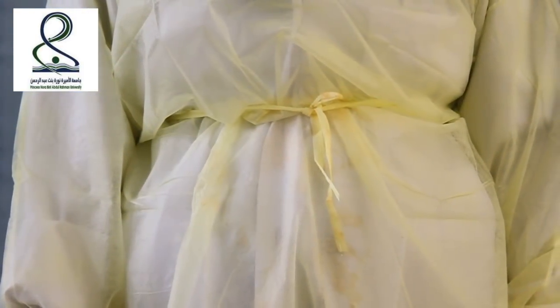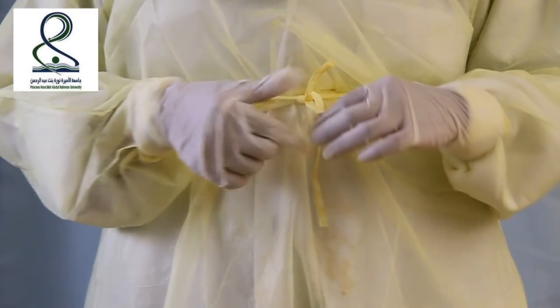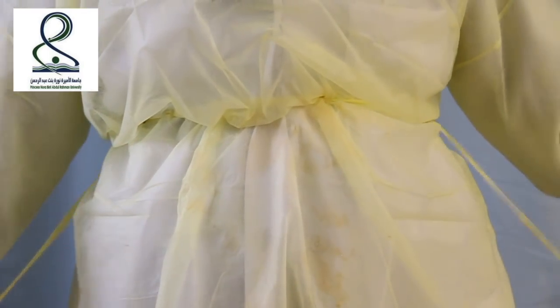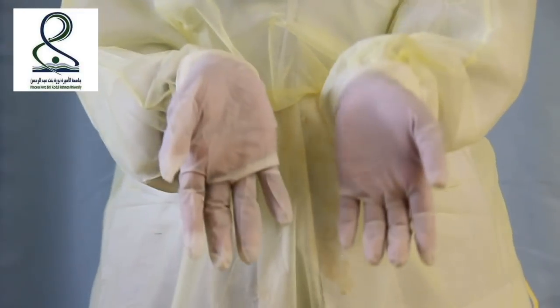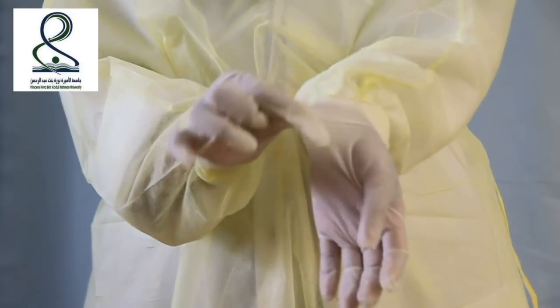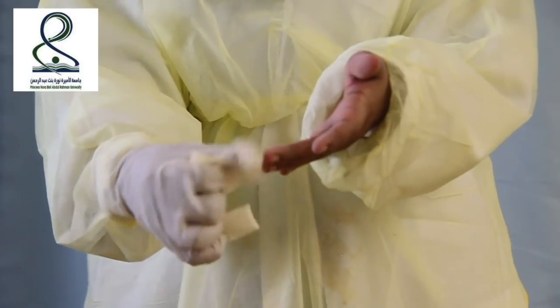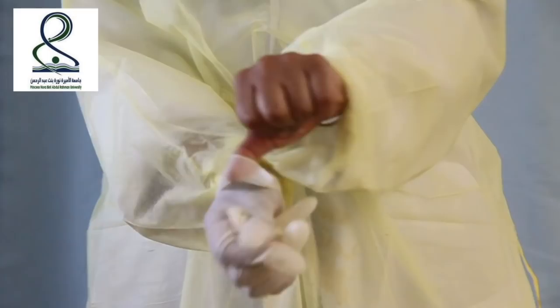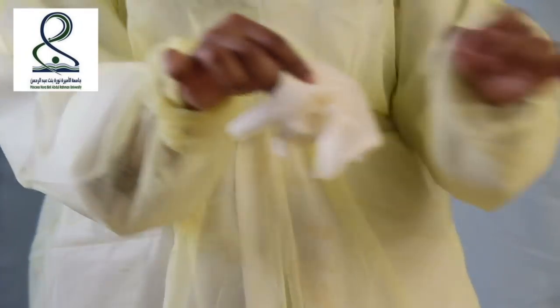Now we are going to remove the PPE. First we start with the waist part — we untie it, and then remove the gloves and throw them in the garbage bag.